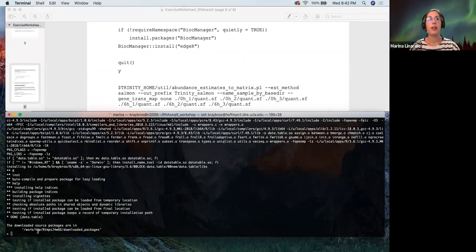I hope everybody has their EdgeR installed, or we can wait for a few more minutes. Okay. So if you get that message, do you want to update all, none, or some? You can just press A for all. Sometimes it asks that, sometimes it doesn't. Okay.